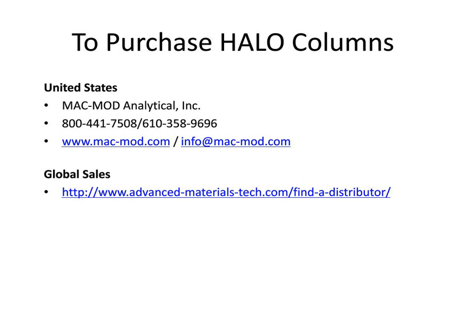Now, what we find is that even with the smallest volume UV detectors, there's a significant increase in band dispersion before the mass spec. So in order to obtain the best data, we go directly into the mass spectrometer. Now, with capillary columns, it really is more an issue of how exactly you've put together your hardware. There's a variety of different commercially available interfaces. In our case, we use one that's relatively off the shelf and have minimized the band dispersion, but it's always going to be a problem when you're interfacing mass spec.